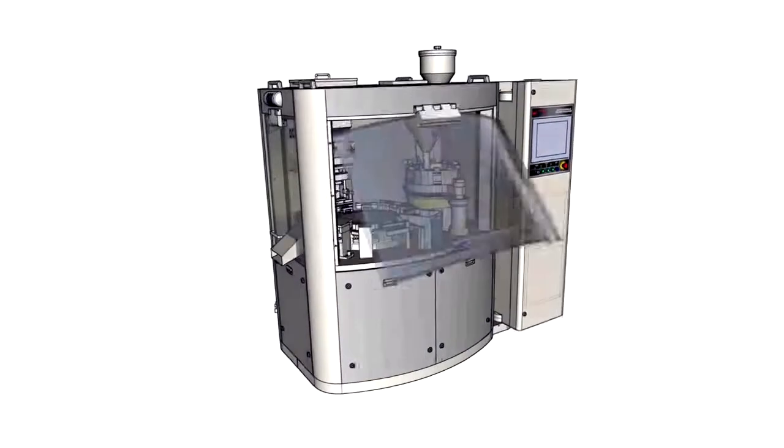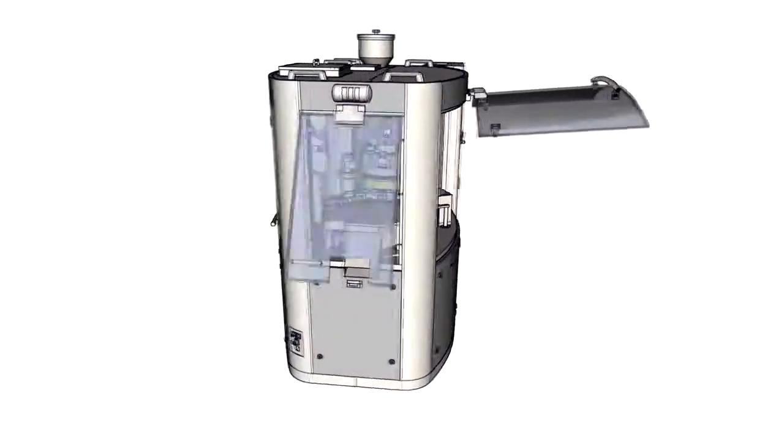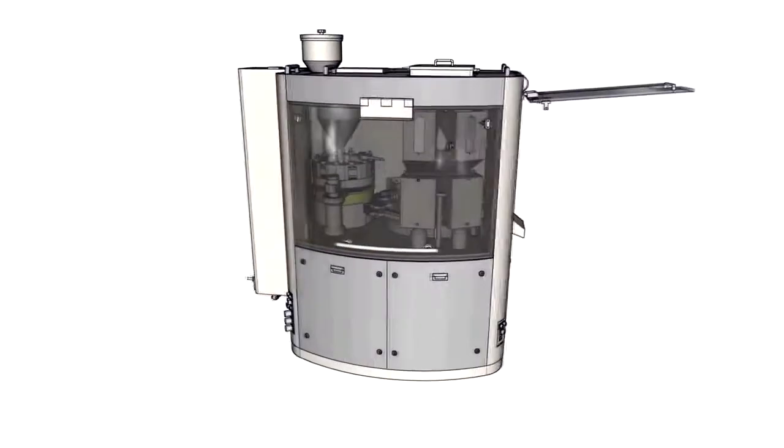Modern, round-style, new-designed main body maximizes the maintenance and visibility through a four-door system.